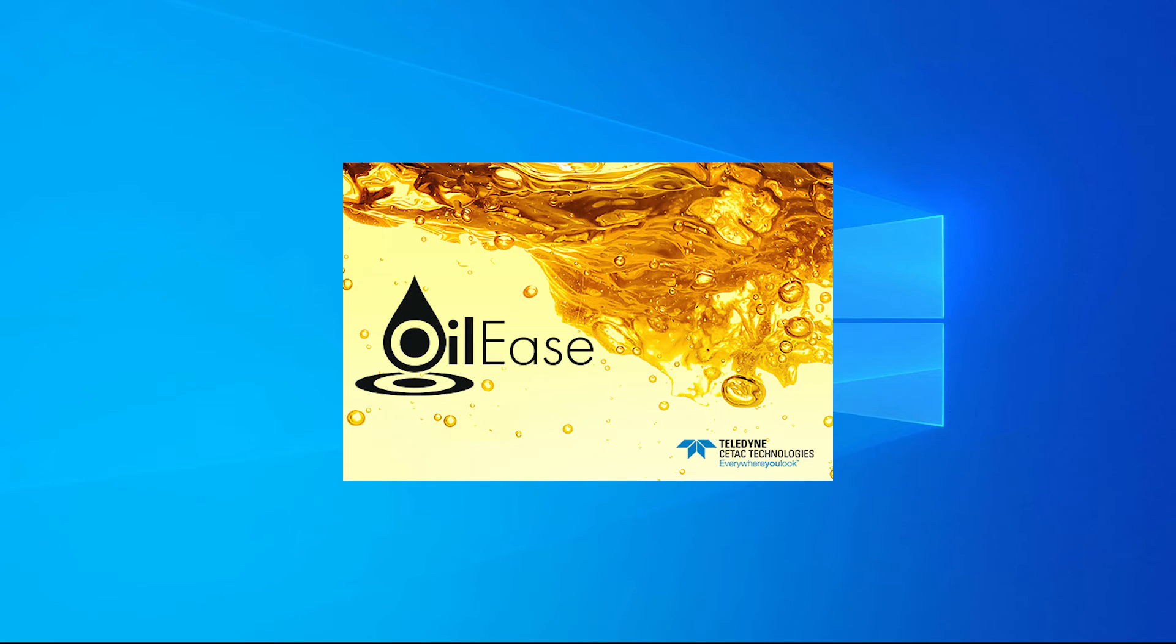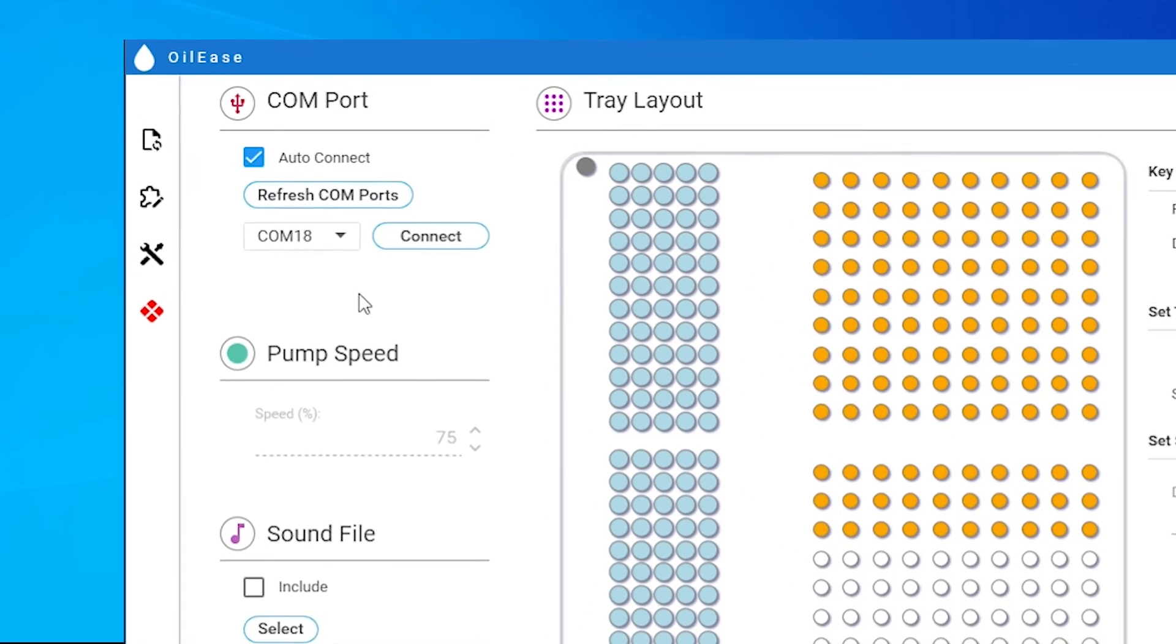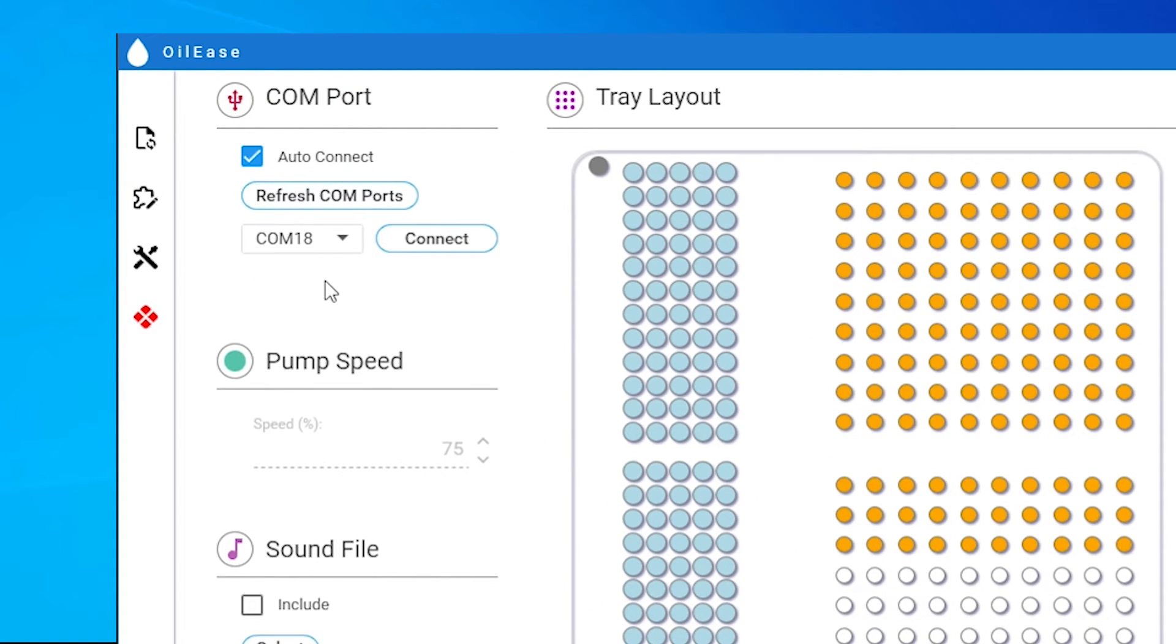Open the OilEase software. On the configuration screen, select the COM port where the autodiluter is connected.